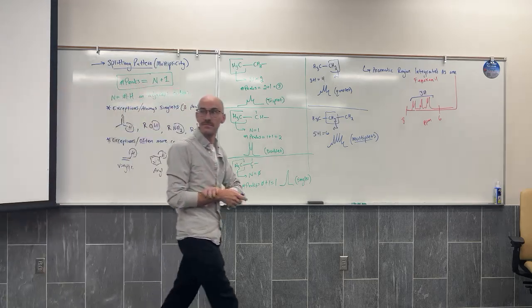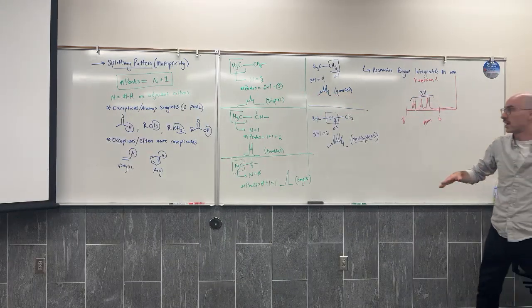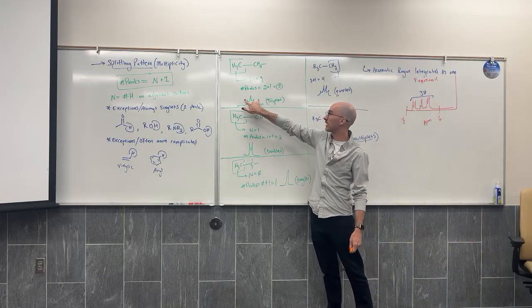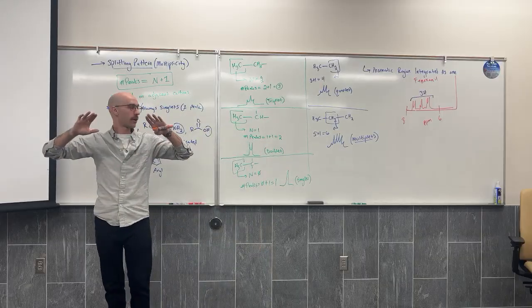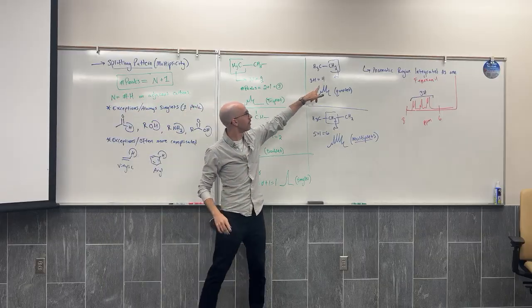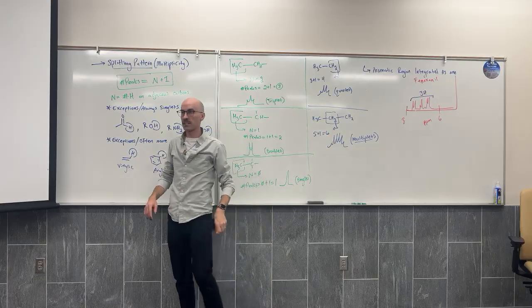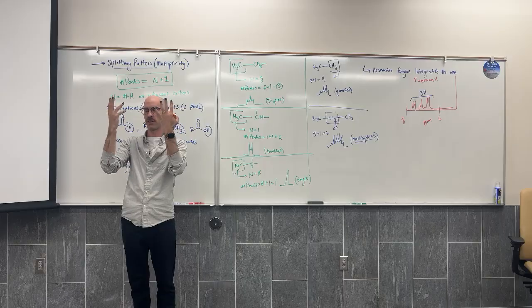Will there always be symmetry? You're noticing the symmetry, right? The doublet is nice and clean. The triplet is clean. It actually follows Pascal's triangle, where the peaks in the middle will always be higher than the peaks to their exteriors, and that has something to do with the combinations of spins.